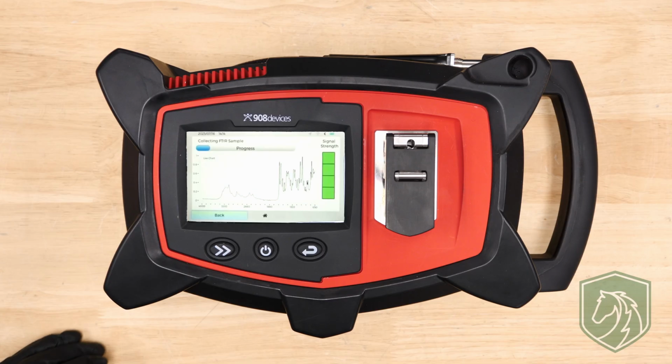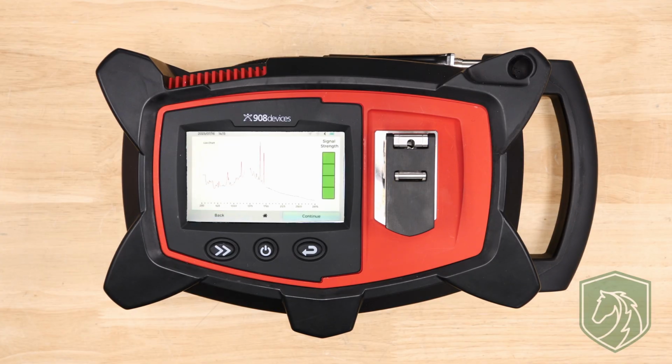The FTIR is the ideal pre-screen to the Raman, as it will not energize the sample. The Raman collection begins immediately after the FTIR is finished. The sample does not need to be moved to perform these analyses.